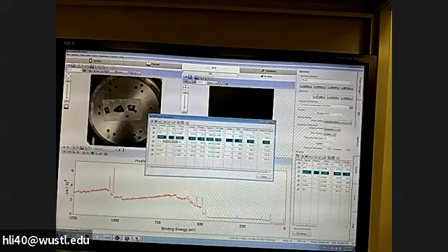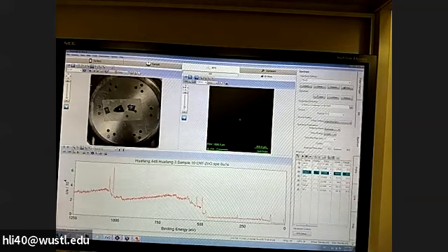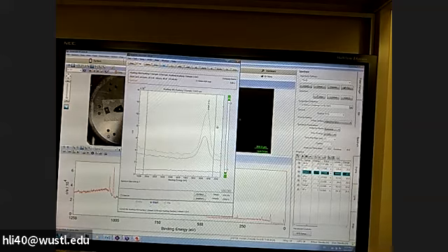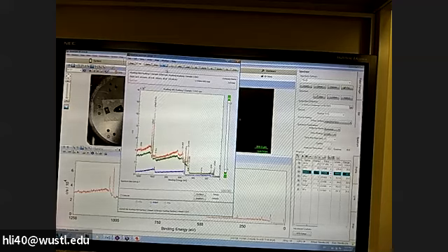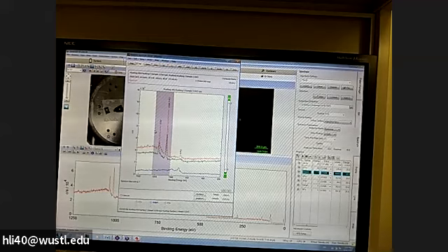And the zinc, I would like to change the default, which was 2p3. I would like to use zinc 2p. No, they don't have 2p. 2p3 is fine. If we take a look at zinc 2p3, which is here, 2p3 is fine. If we want, we can include the 2p1 there too.